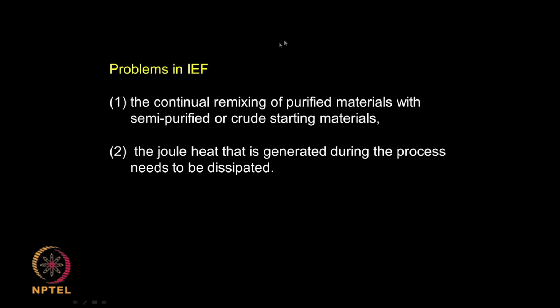So, what are the problems? Continual remixing of purified materials with semi purified, that can happen. Heat is generated during the process, because when there is a mixing and then the pH changes, a lot of heat is generated.